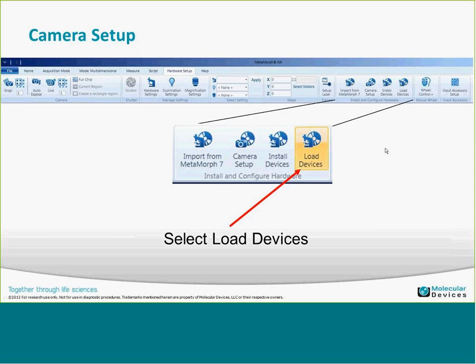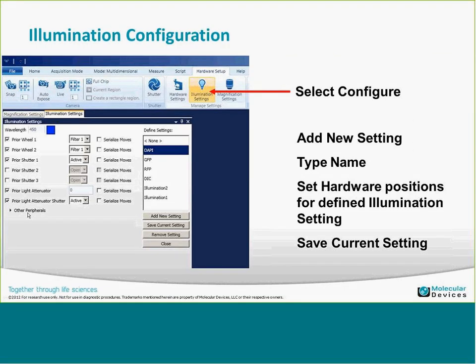Metamorph NX also has an Other Peripherals option, so you can now be more specific on other hardware aspects you may want to control for a specific illumination setting. In Metamorph for Olympus, certain components were classified as either a magnification component or an illumination component and there was no way to switch between the two. Now you have the ability to control those components with Other Peripherals, so a device associated with magnification can also be configured with an illumination setting.